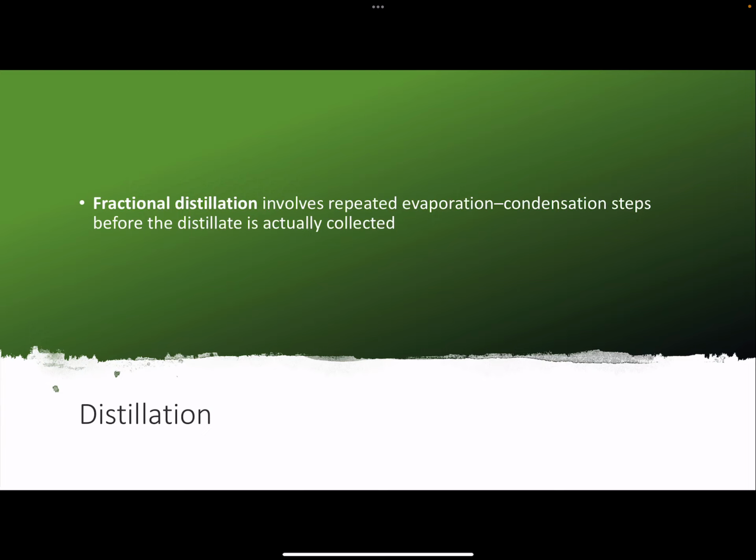Okay? One modification of our distillation is what you call the fractional distillation. So, in this case, meron tayong fractional, no? Si simple distillation kasi, it's only effective in some cases, which were mentioned earlier, no? So, kapag magkalayo yung ating boiling points, pwede tayo mag-simple distillation lang. Number 2, kapag dalawa lang yung mixture natin, pwede tayo mag-simple distillation lang. But if it's a more complex solution, ibig sabihin, mas maraming constituents, and also mas magkakalapit yung boiling points. In that case, pwede na tayong gumamit ng fractional distillation.